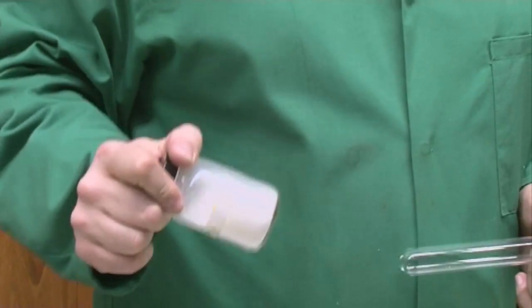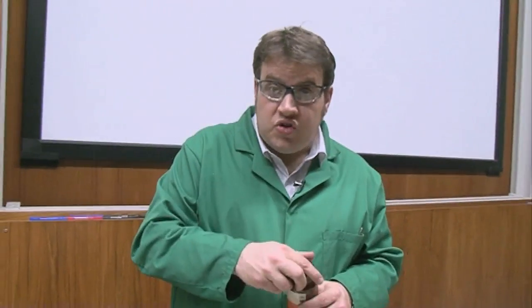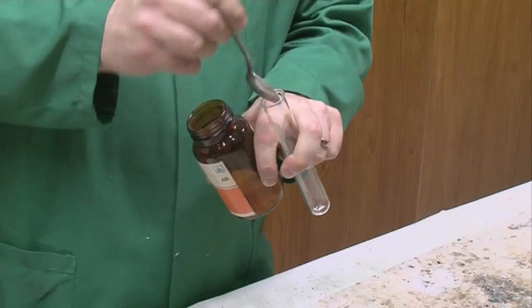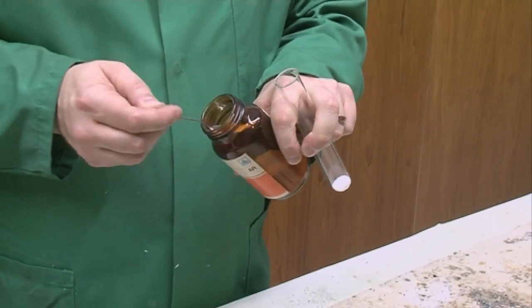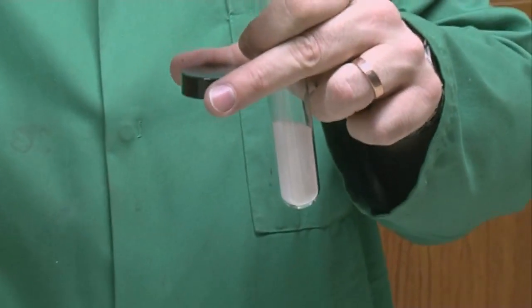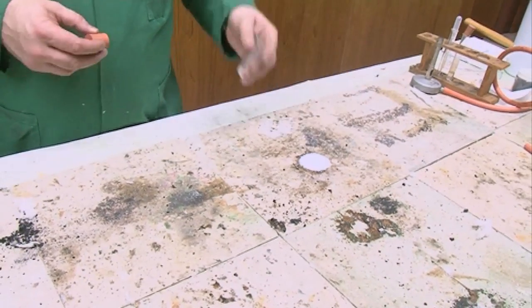So we're going to use the same mixture of sugar and chlorate, but this time I'm going to add a small amount of a different metal salt - barium nitrate. And again I'm going to add some of my combustion mixture. We're using the energy of that combustion of the sugar to excite the barium so that we can observe its emission spectrum or the flame test colour. Again pour it out onto a heatproof mat.